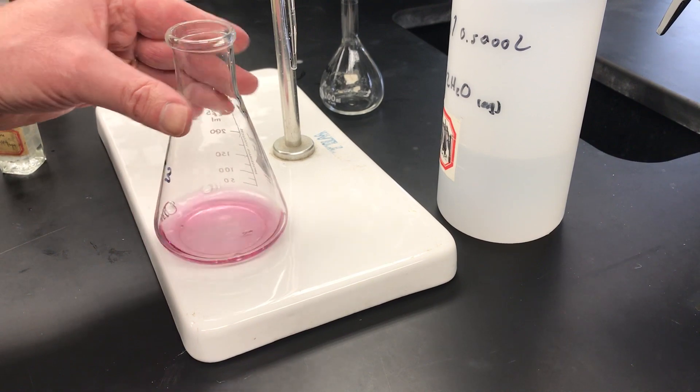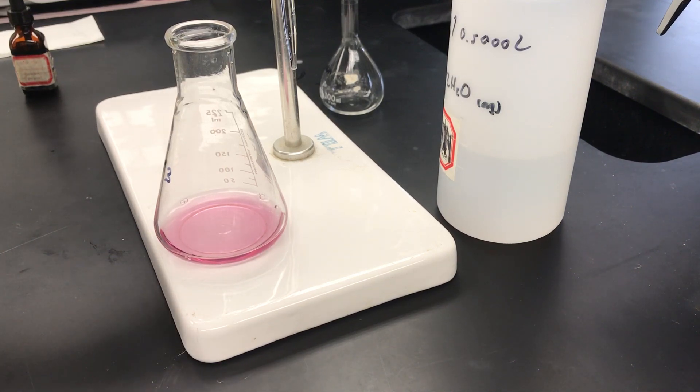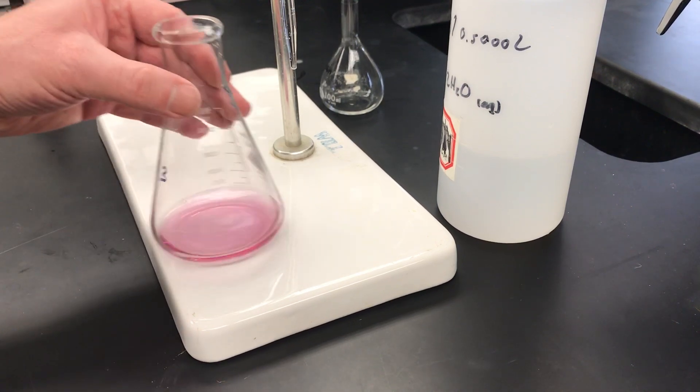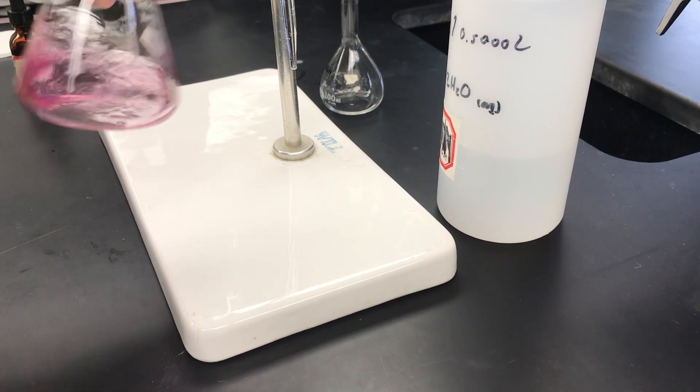The next thing we're supposed to add is 10 drops of the magnesium EDTA solution — that turns out to be about a dropper full, but we'll count them out. One, two, three, four, five, six, seven, eight, nine, ten. At this point I'm going to go ahead and shake this up nicely to make sure we're in good shape.